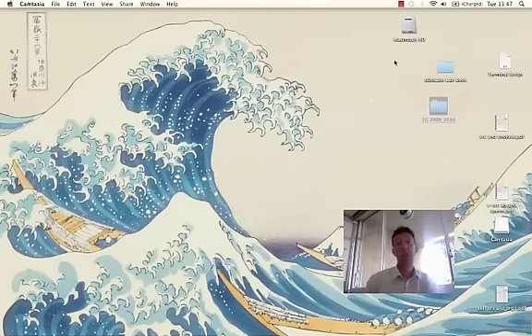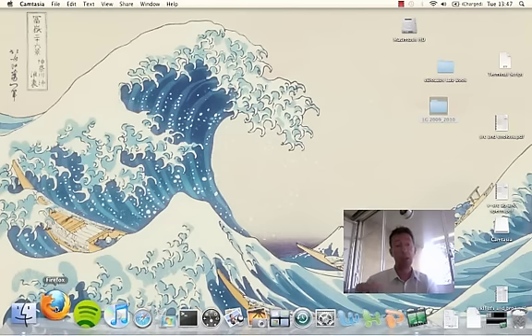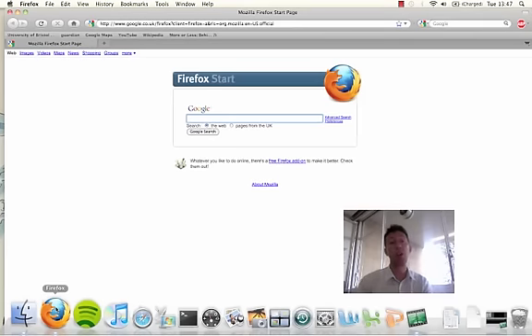So my name is Gus Cameron, I'm part of the eBiolabs team, and I'm here to give you a tour to show you what we've been up to at the University of Bristol for the past year. eBiolabs is a project designed to change the way in which we deliver undergraduate teaching.